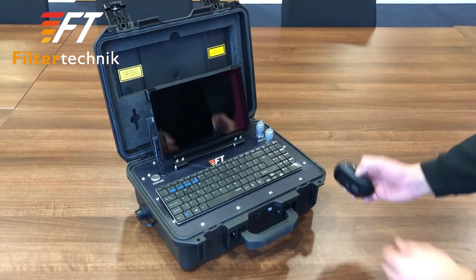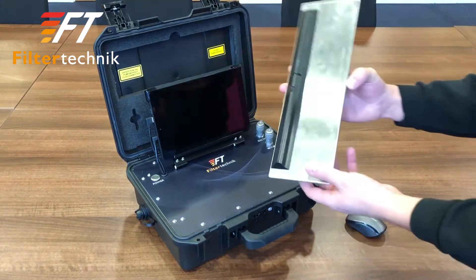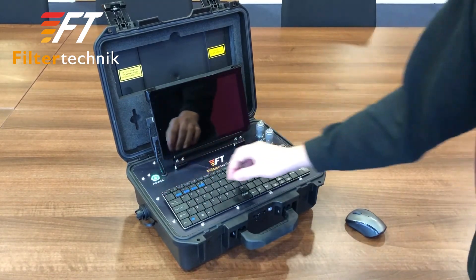Before we can start to use the unit we must start by switching on all of the devices. So we switch on the mouse, the keyboard, the unit and the tablet itself.